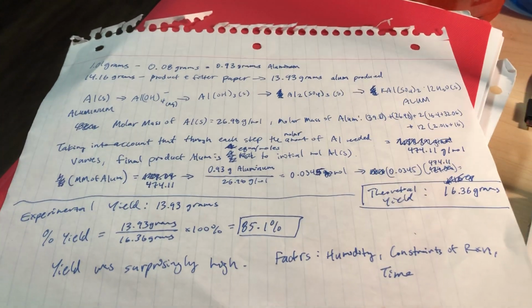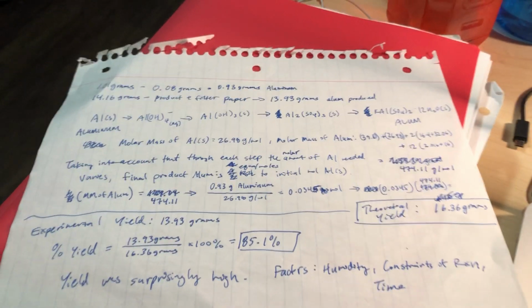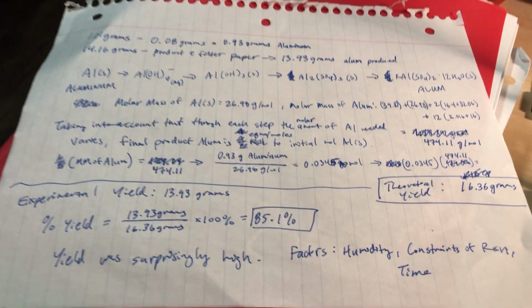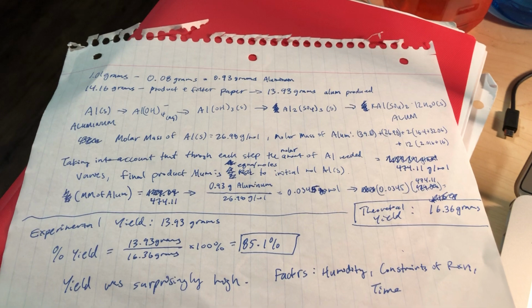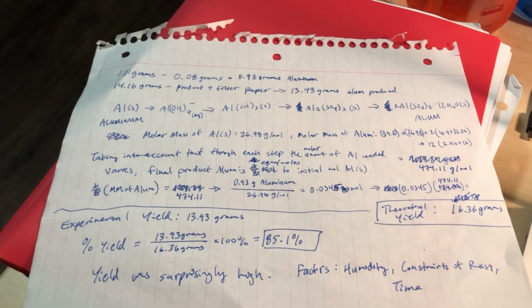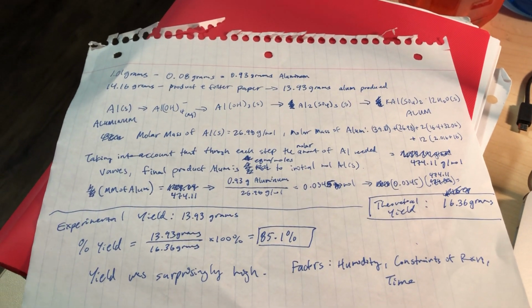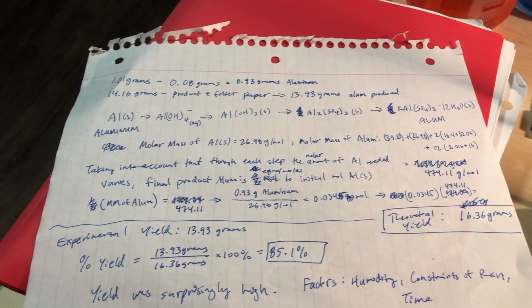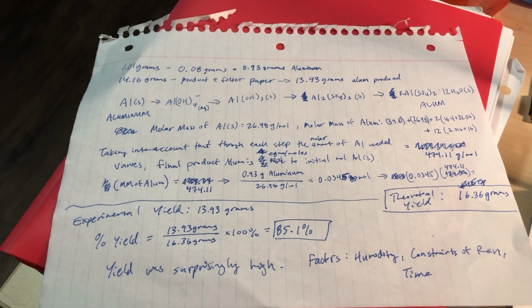So in my opinion, the yield is pretty high. Previously, I've gotten much lower yields, of course. And some other factors and reasoning is that, in terms of letting it dissolve into the acid, and then also getting it out of the acid in the ice bath, over time the temperature of the ice bath warms up, so it's really hard to control and make it so that it actually pushes the reaction fully to the right, so that you can get the full amount of alum out of the solution. But yeah, overall the growth looks pretty good for this week, and that'll be my video.